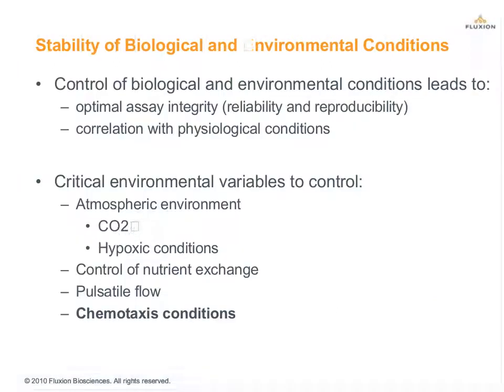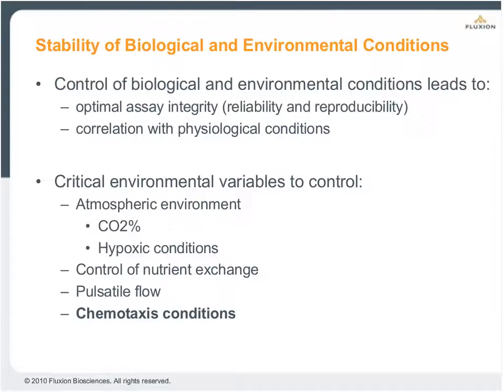Besides shear stress, using flow for biological assays confers a number of additional benefits, such as full management of the microenvironment that the cells see, which is important to ensure consistent cell behavior time after time. As well, this provides the opportunity to change conditions reliably to create areas of continuous chemoattractant concentration to enable chemotaxis, for example. And we'll talk about this a little bit in the coming slides.